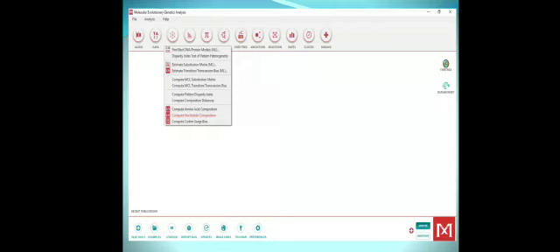When you click on that option, it will take you to another page from where you can select the file for which you want to perform nucleotide composition analysis. The file can be a text file, sequences in FASTA format, or a multiple sequence alignment file, or you can also calculate nucleotide composition directly for a sequence by retrieving it from a database. The software is connected to a database. You can directly import the sequence from the database also.